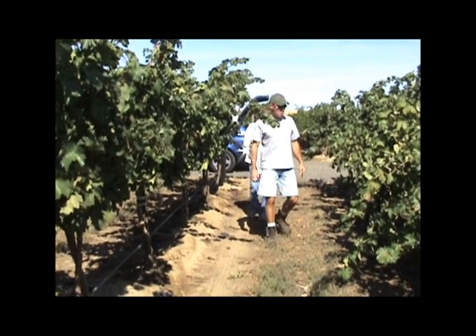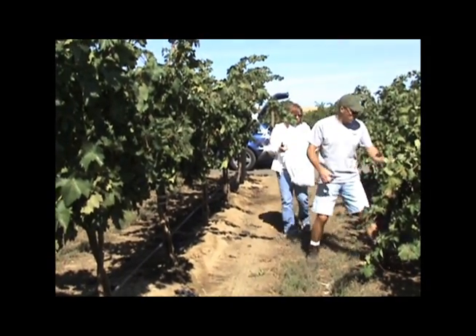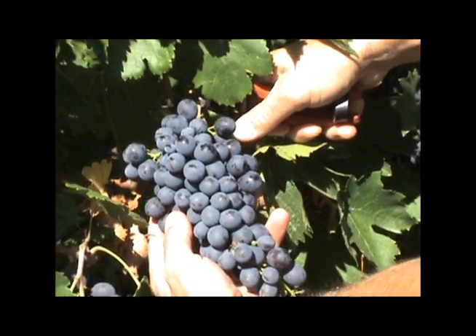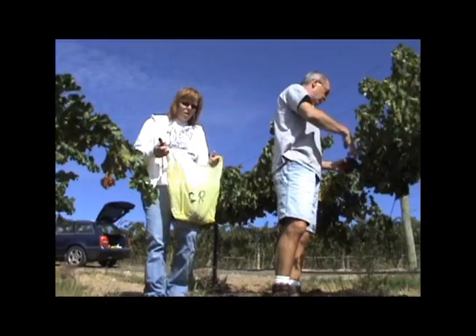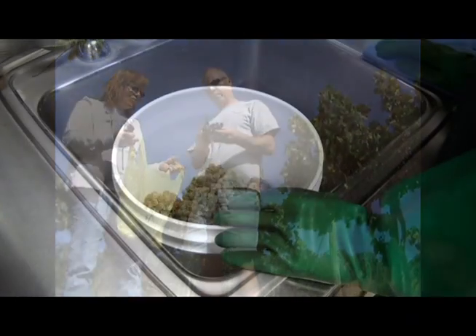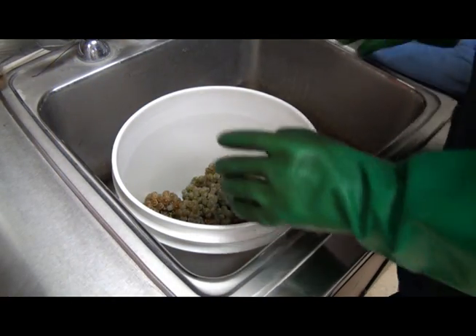A sample of grapes must be obtained. The sample should represent the variety of growing conditions, and not just from a single plant, to obtain a representative sample of the vineyard. Once the grapes are obtained, they'll need to be crushed.